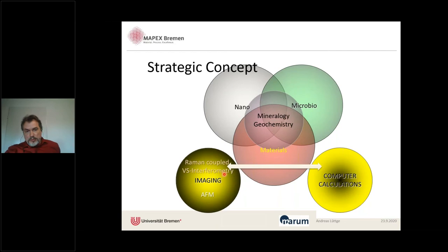And when I came to Bremen about 8 years ago now, I decided that it would be a good idea to couple that interferometry technique with Raman. And Bruker was kind enough to work with us, together with Renishaw. And so we developed the first prototype that is in the MAPEX core facility in Bremen now, and you can actually access that through the MAPEX core facility if you have some kind of application. And in our everyday business, we are utilizing that, how should I say, complementary with atomic force microscopy, and I will give you some examples.